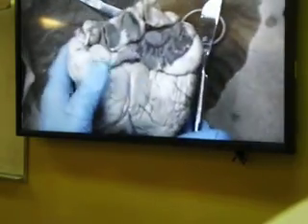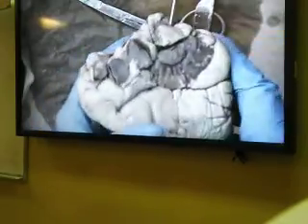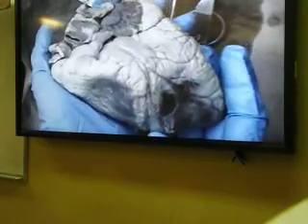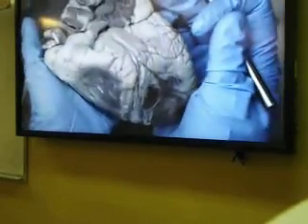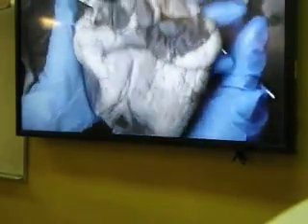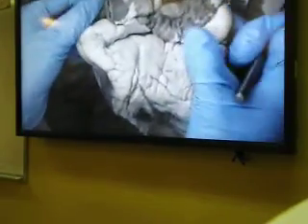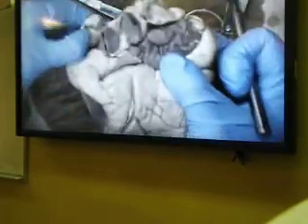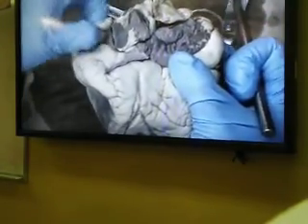Alright. Once we understand that, we need to see the chambers. Everything is similar to the human. So the first thing I understand is that the heart is tilted towards the left from the anterior view because the left side is more muscular. You can hold it towards you this way, or you can hold it this way. Either way, I want to talk about the right side first. So again I find this dog ear-like structure on the right side. The structure is the right auricle. But if I ask you what chamber is it?